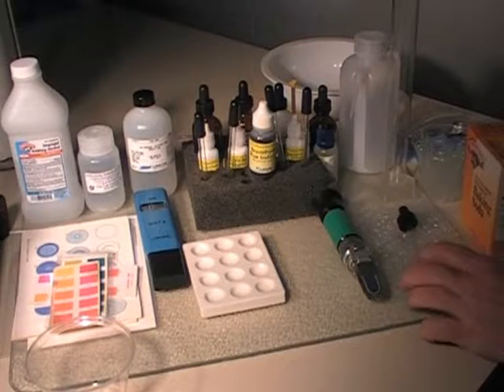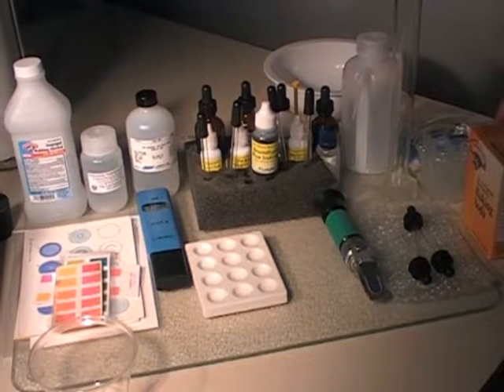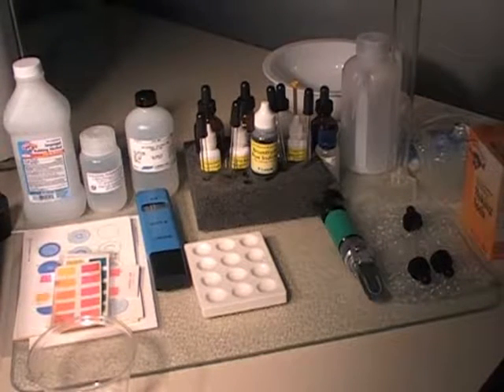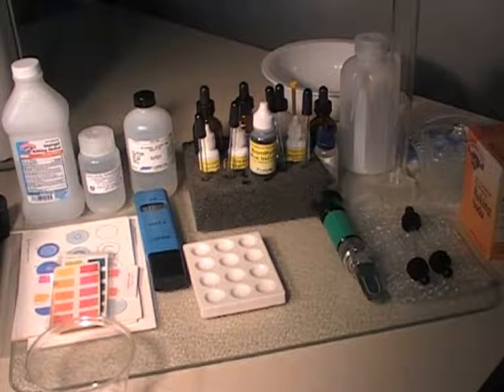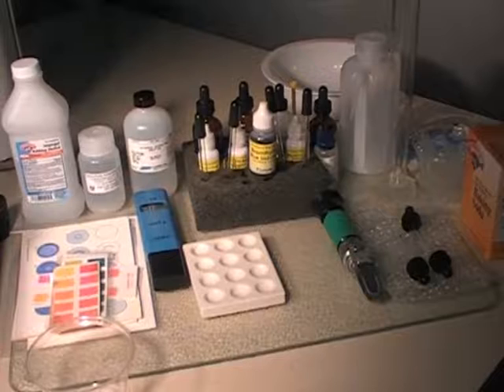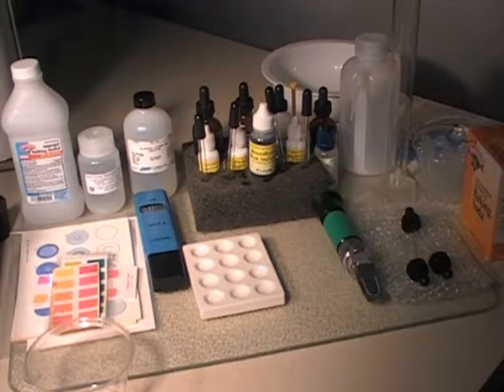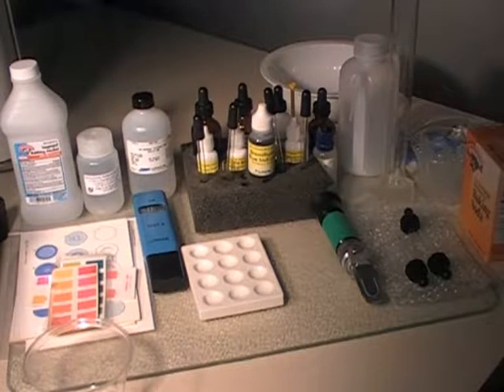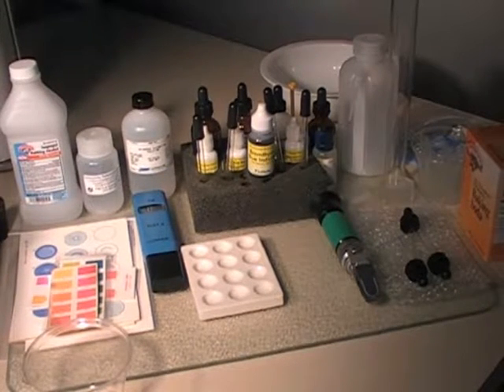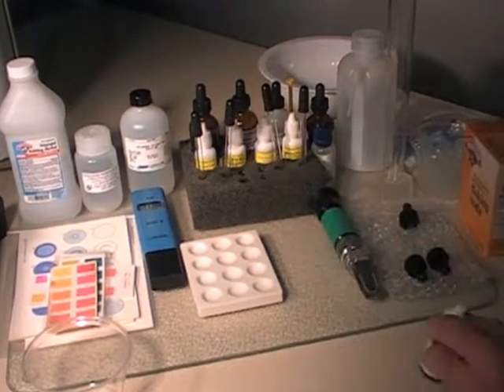I'm going through everything you'd have to buy from Pike first, and then we'll get into other equipment you can buy at a regular store. Your next piece of equipment is a large set called the UPH3 kit, which gives you everything you need to run both the pH tests and the urea tests. I'll explain why we like this pH testing kit.